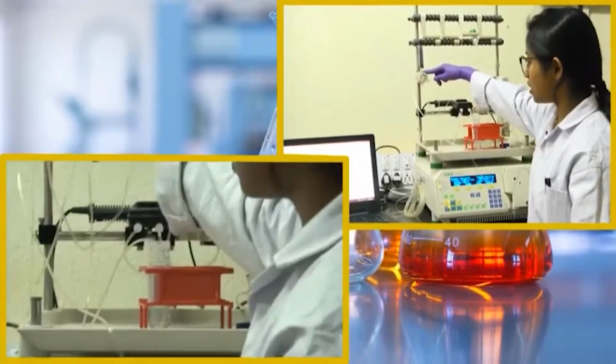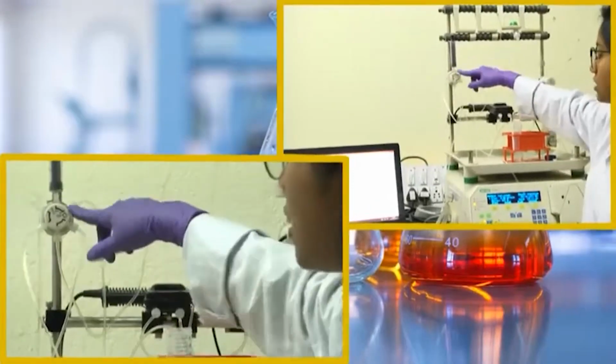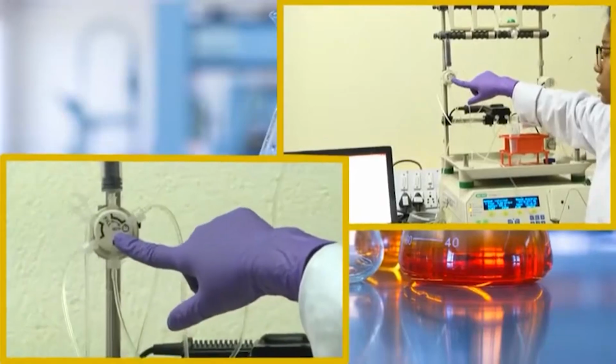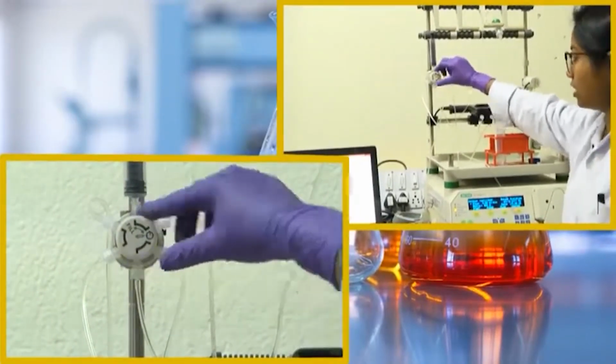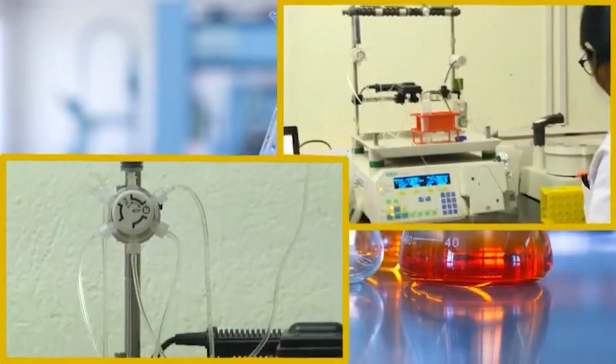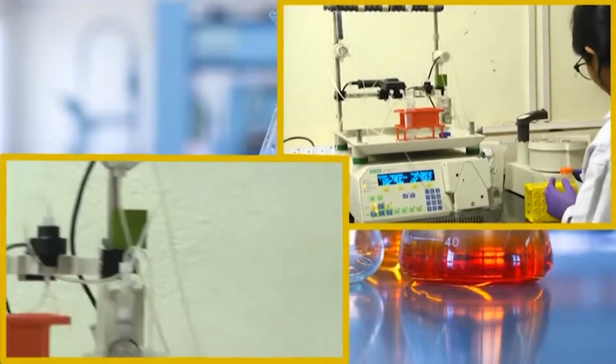So, this is the syringe fill, that means it has a mark of syringe. Basically now, in this particular channel, you can load your sample. Before loading, I will take my sample in this syringe again.